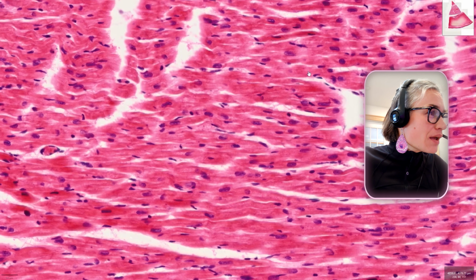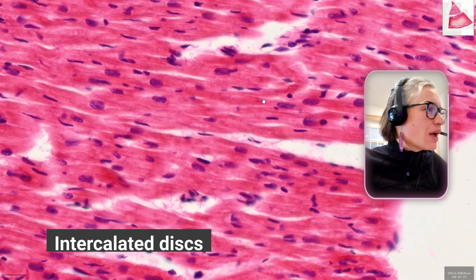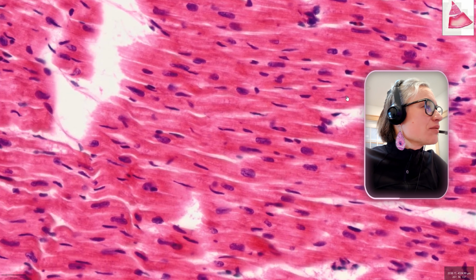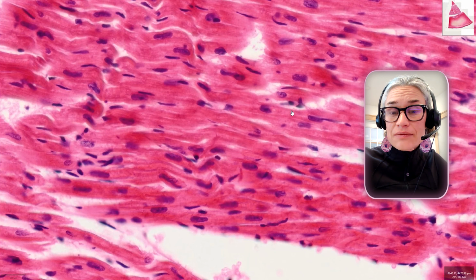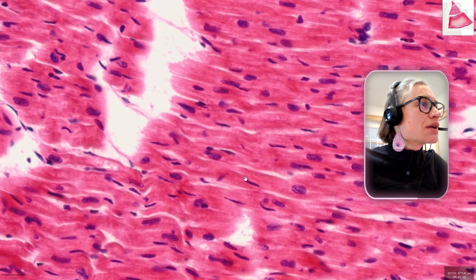Let me find one first. Okay, this may be one. They are pretty subtle. And if we don't have a perfect slide, which, you know what, in real life, sometimes you don't have a perfect slide. But let's find a few more that look like it.